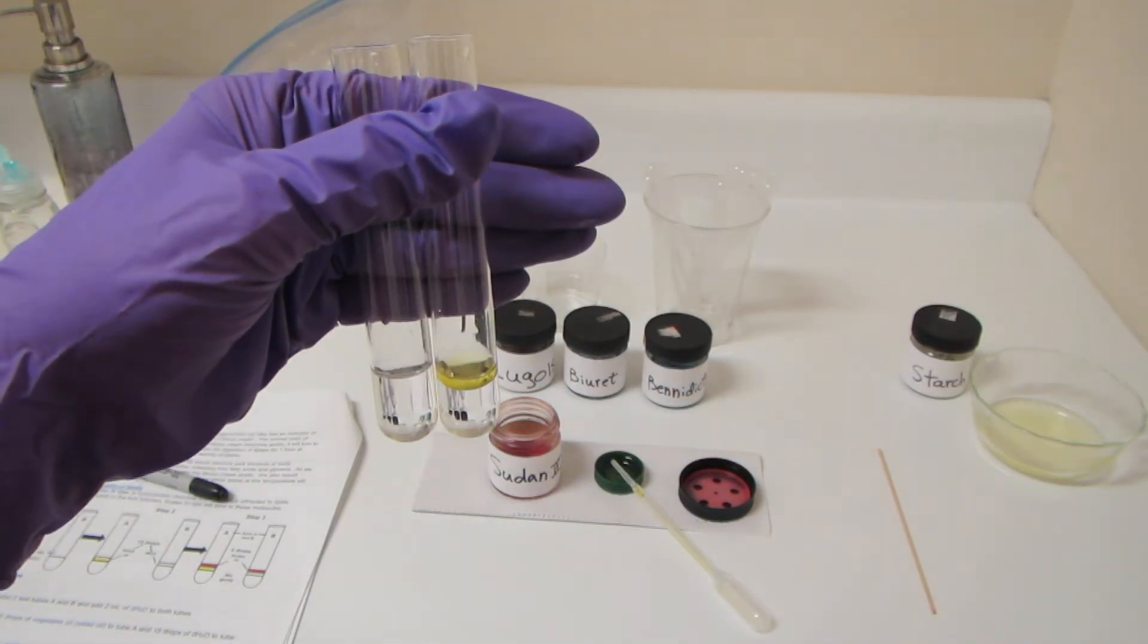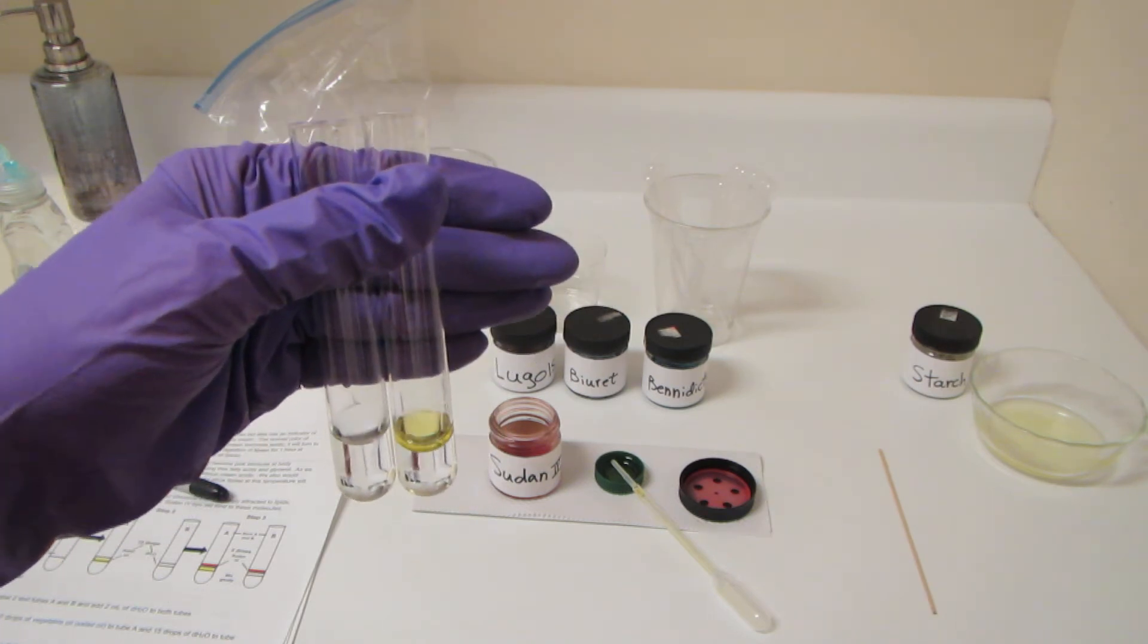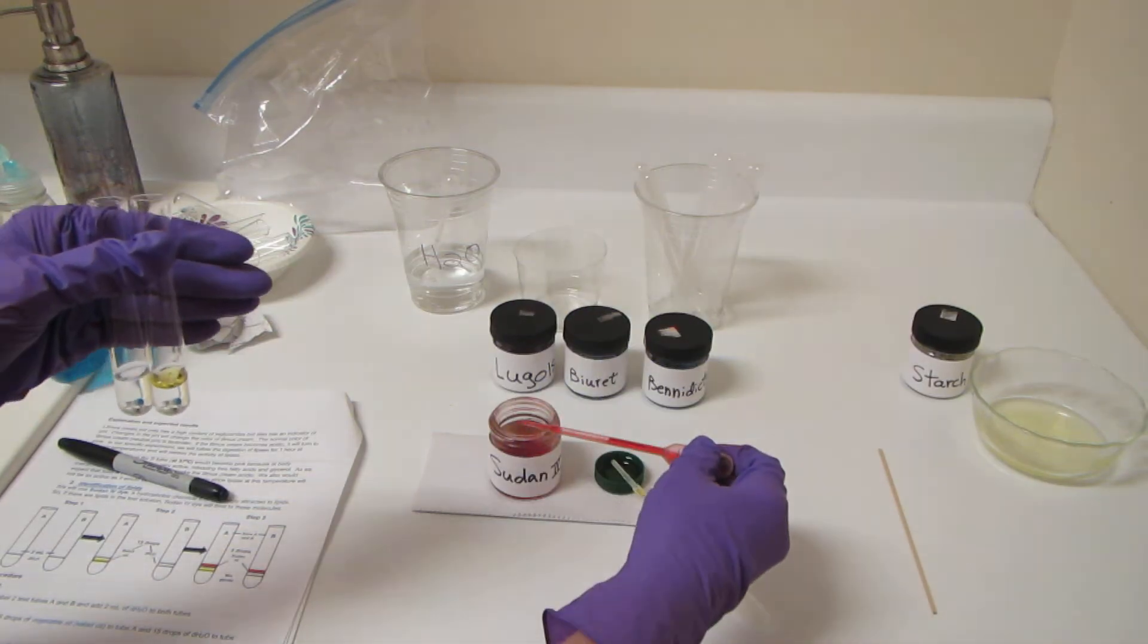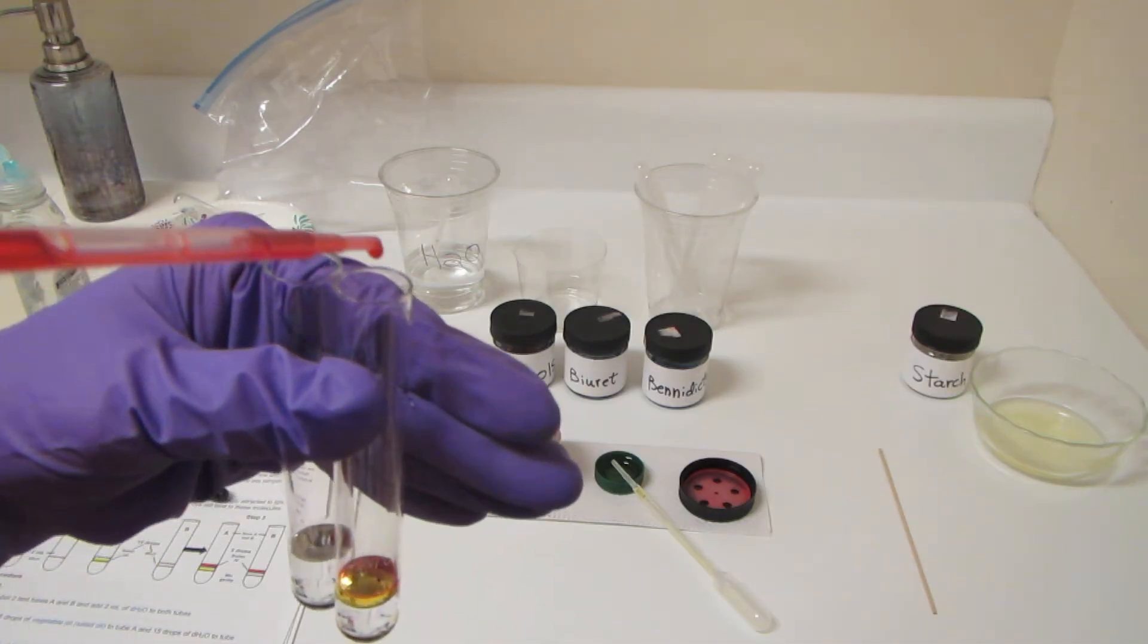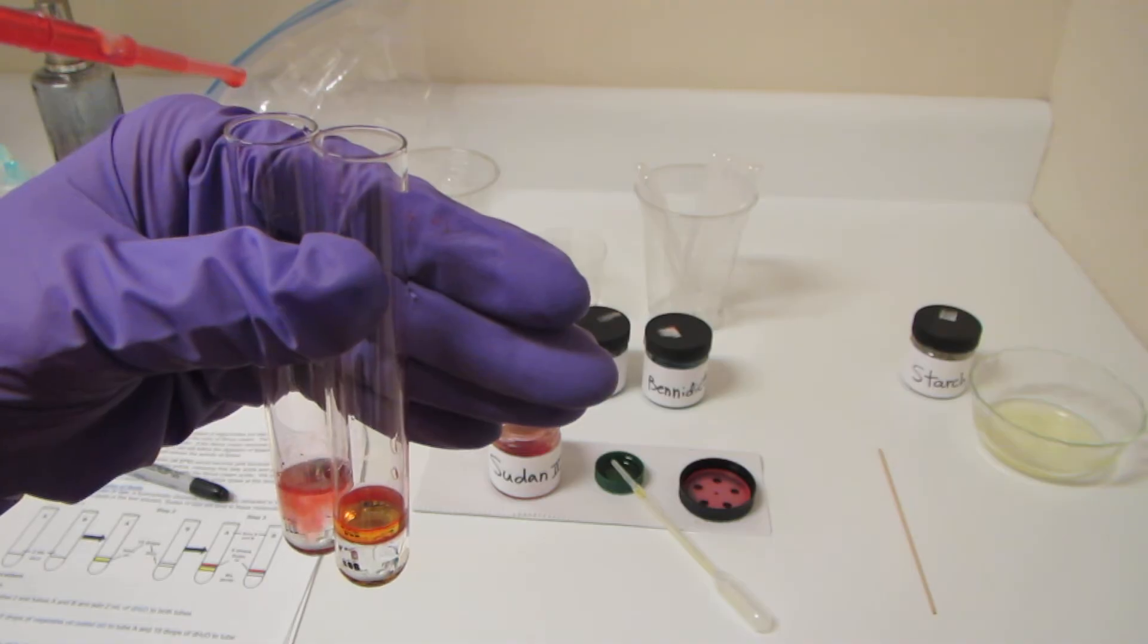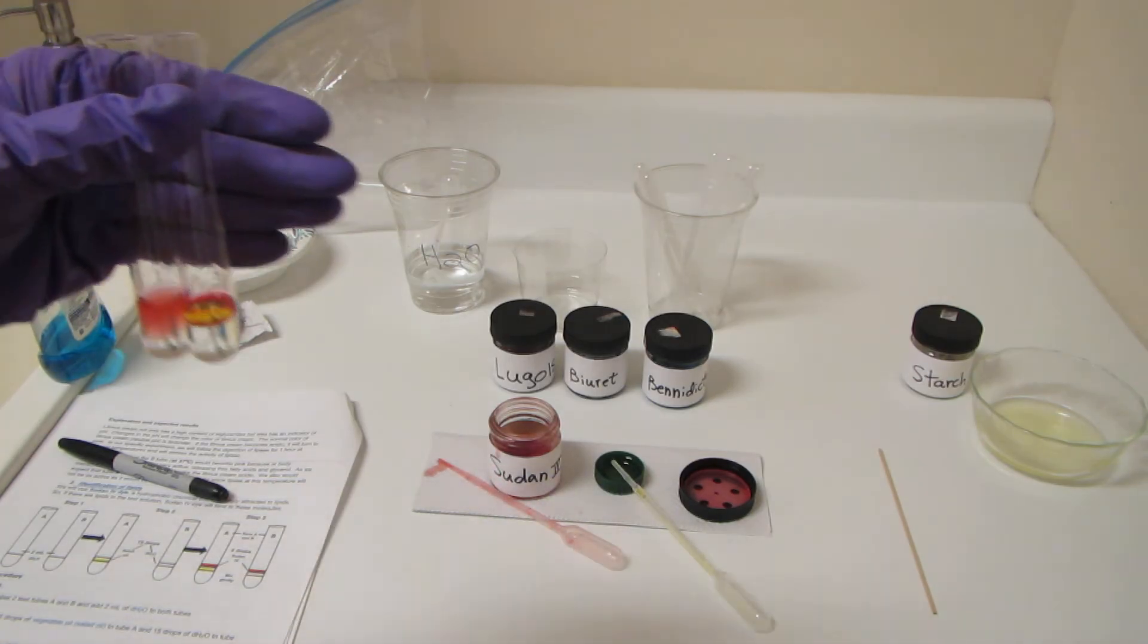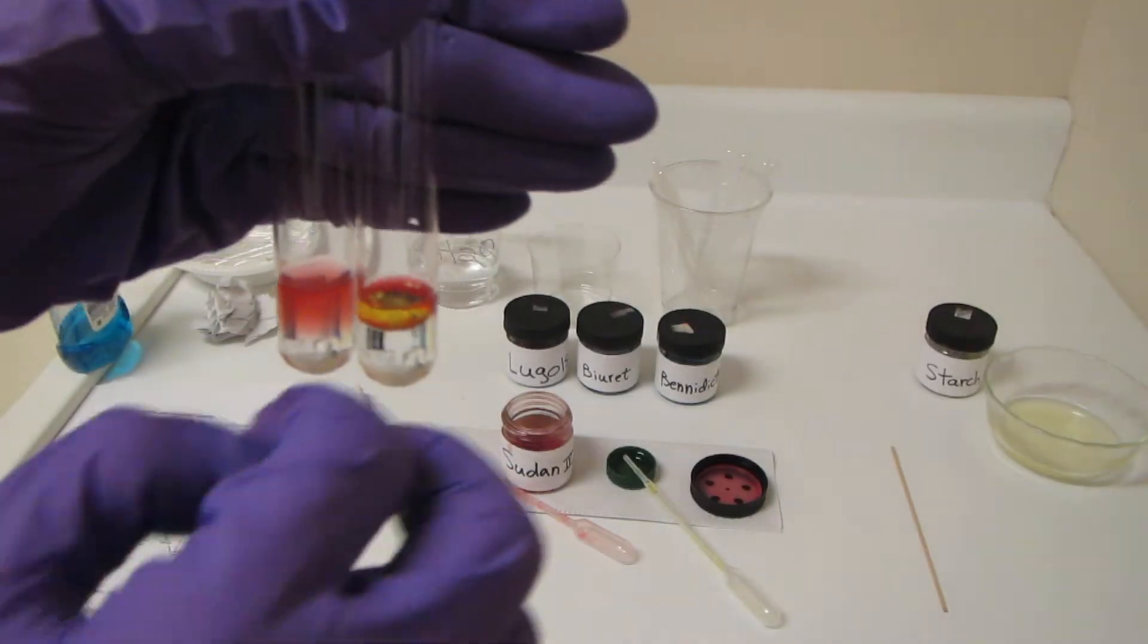So what I'm going to do next is take some Sudan 4 dye. I'm going to take five drops and put five drops into each of these test tubes. Trying very hard not to turn everything pink. Now what we're going to do is mix these up a little bit.